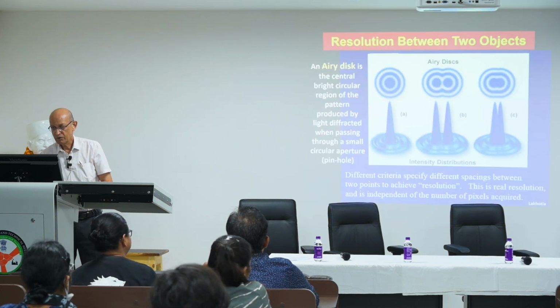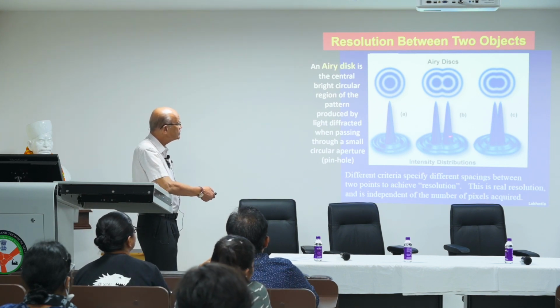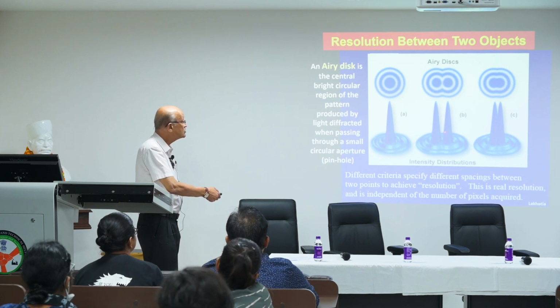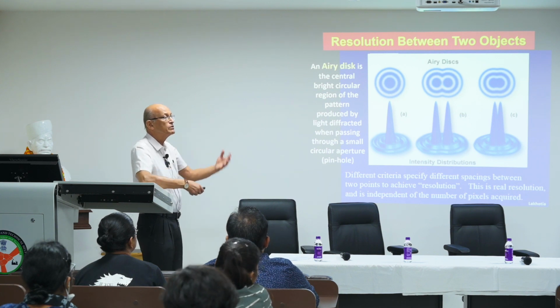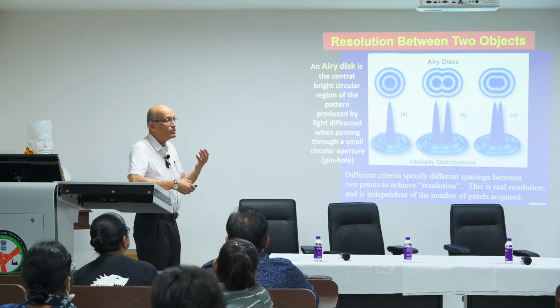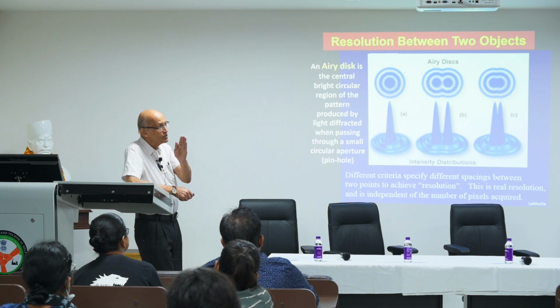Now if your pinhole is larger, then these two objects, their Airy units will tend to merge, because out of focus light from different planes will merge and you lose that resolution. So one Airy unit is defined as the limit of resolution. For different objective lenses, it will vary.